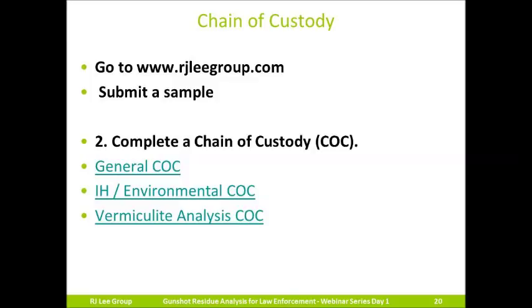You can go to www.rjleegroup.com. Click on Submit a Sample. Under Complete a Chain of Custody, you will see three options. We have a General COC, IH Environmental COC, and a Vermiculite Analysis COC. For submission of forensic evidence, you want to choose the General COC.